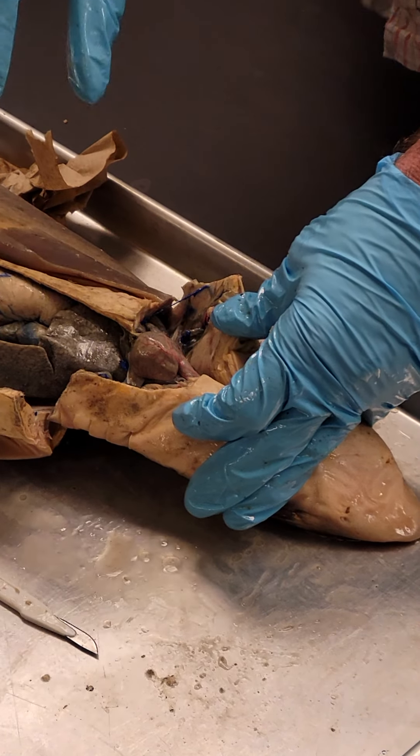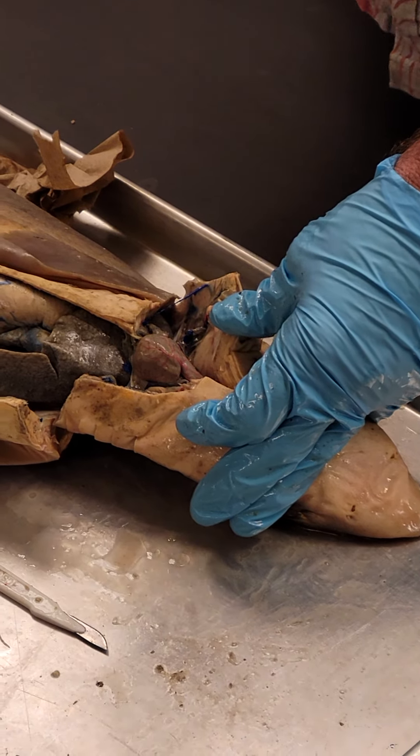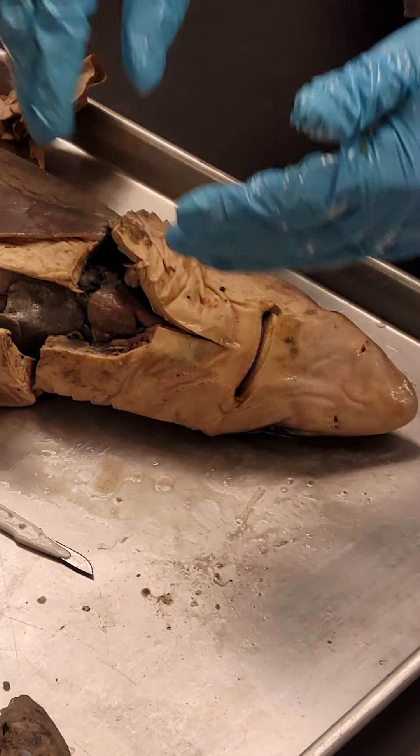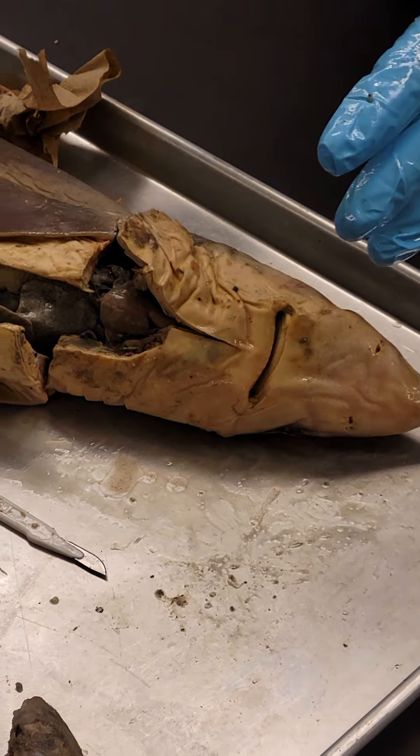Think about this because on the frog we're going to have a three-chamber heart — the atrium has a right and left half because of the lungs. Anyone want to review before I go to the brain?